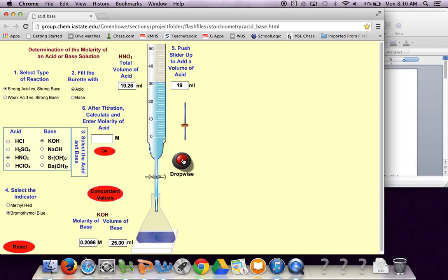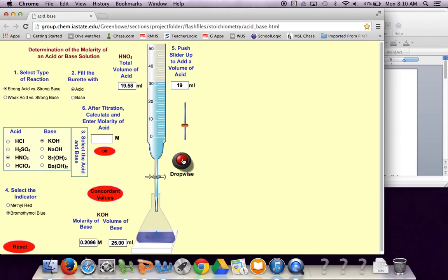You can't hold this down, you just have to click it and we're going to keep doing this. It's a little bit of a slow process but the beauty of a burette is that it adds a very precise amount of liquid and we can very accurately determine how much volume was used.